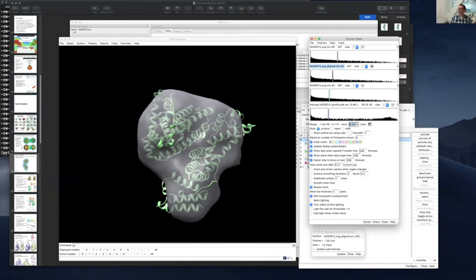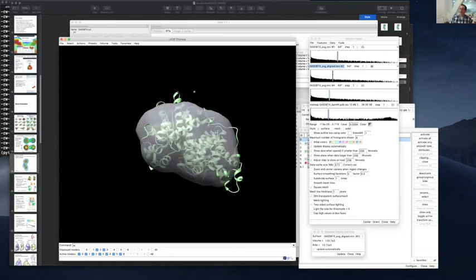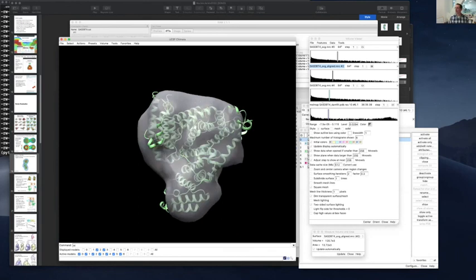And then I know that's a good threshold. So that is another way to do it. The only issue with that are some of the assumptions that are made in the Porod volume estimation and in the errors of actually getting Porod volume. So I've tried this and sometimes it works and sometimes it doesn't. And usually it's just because of errors in the estimation of Porod volume directly from the scattering profile, because there's a lot of leeway there in how you do that. But yeah, so that is definitely another valid way of doing this.